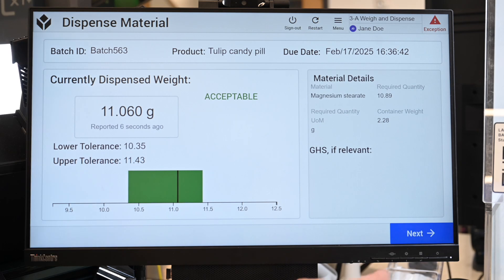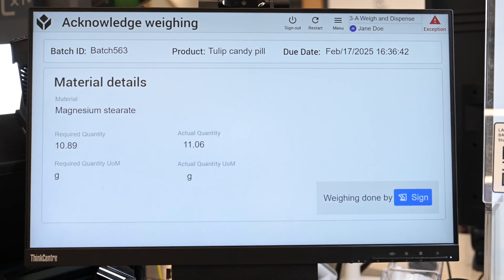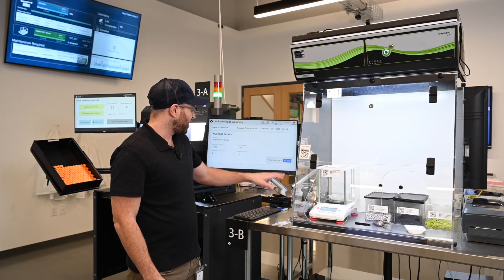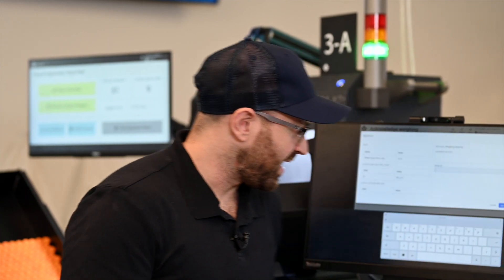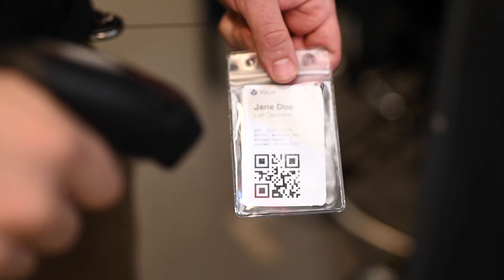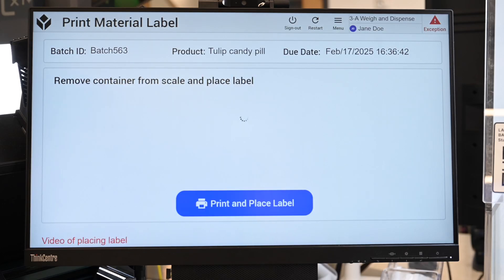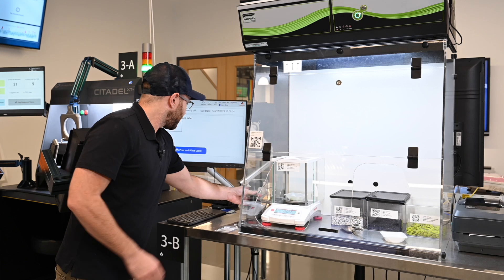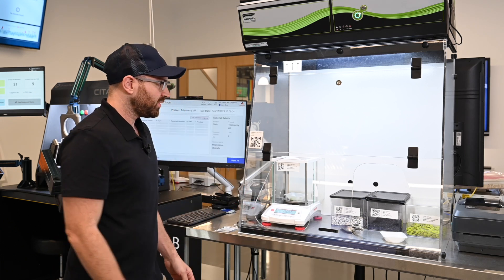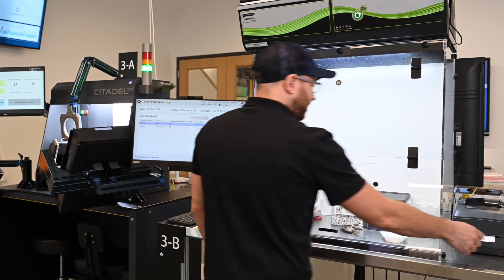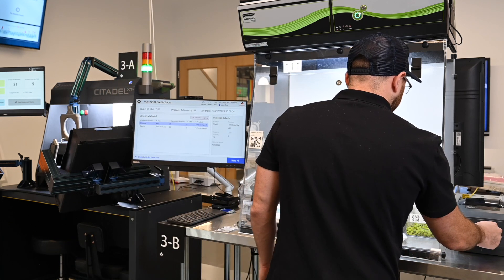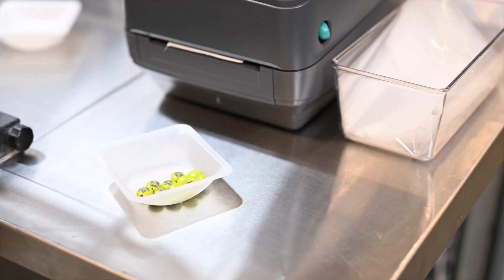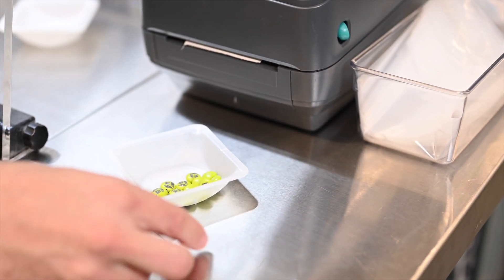At this point I can press next and verify I've completed this by signing off. I will use my badge, but we can integrate with your SAML or other modes of identification. Then I'll print this label. This label will go with the material, and I can begin weighing my other components.